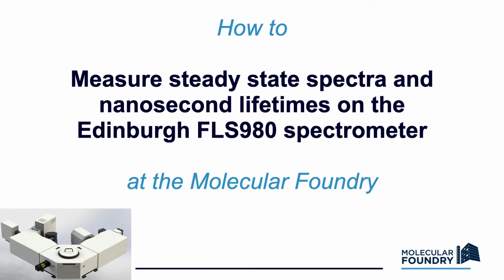The idea is that you would follow along with the video while you're sitting at the instrument performing your own measurements. While the operations here are specific to the foundry, these instructions may be useful for users of other Edinburgh FLS spectrometers.